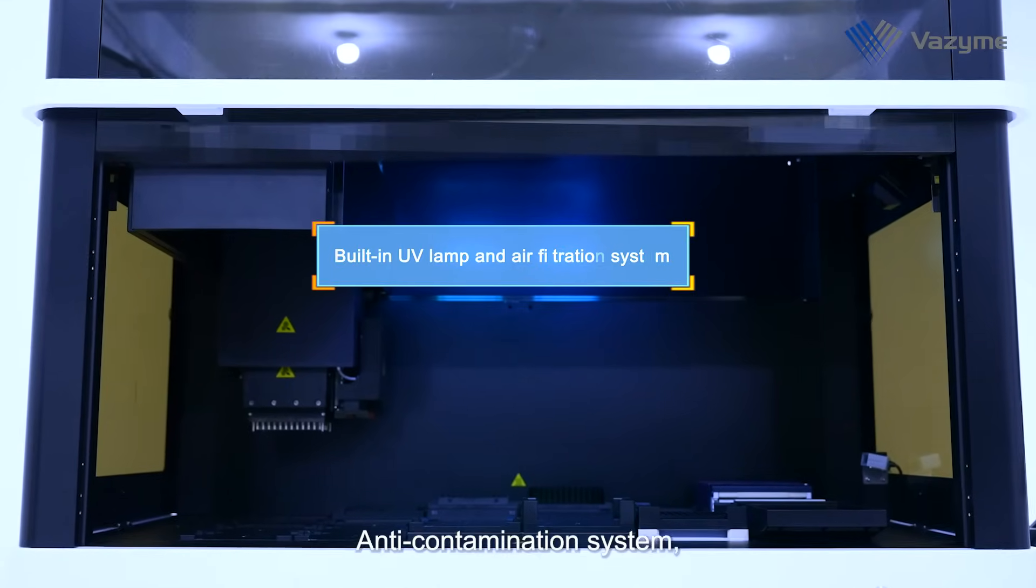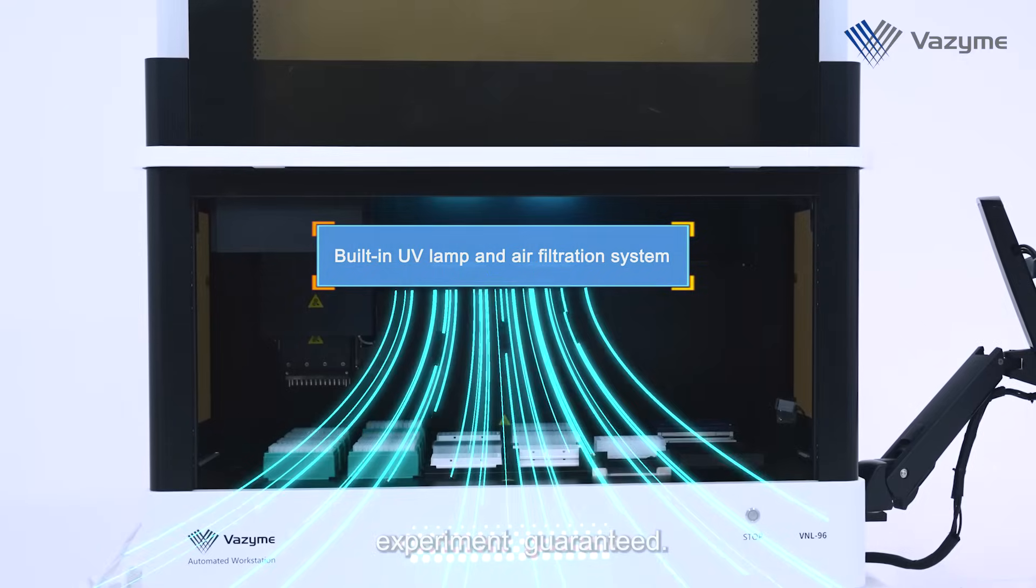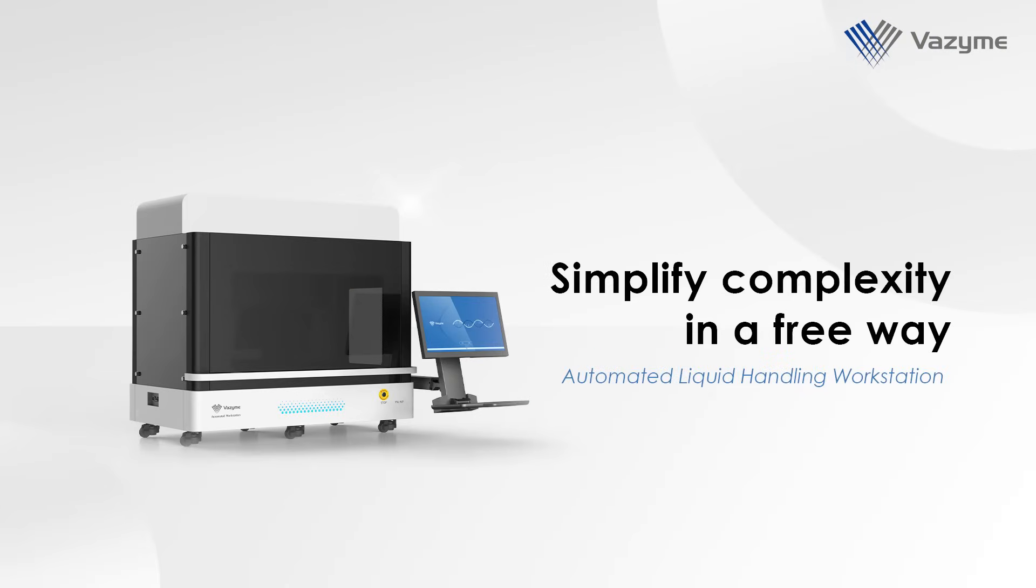Anti-contamination system. Experiment guaranteed. Vazime automated liquid handling workstation. Simplify complexity in a free way.